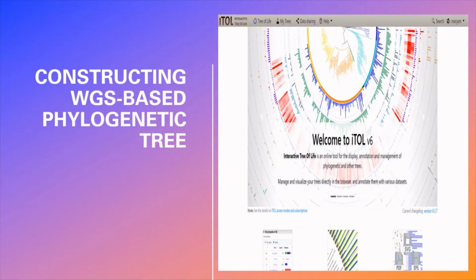How many of you have a Linux-based system right now? Yeah, exactly. So by opting for these two tools, you would be able to handle your data with ease on your own good old laptops. And you would be able to compile the results for your precious genome analysis research papers. So it's more about empowering you guys.